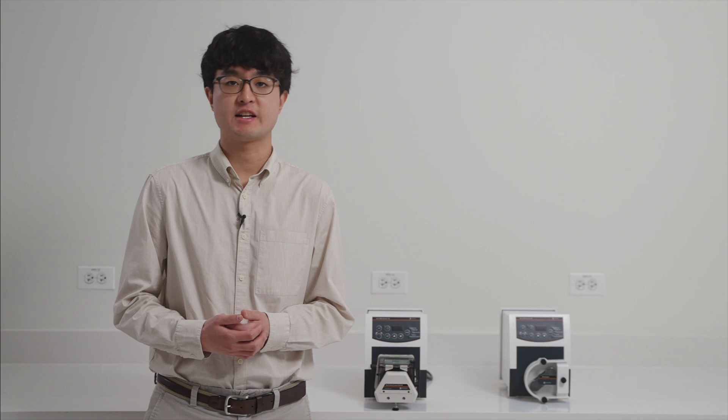Today we'll be talking about our High Flow Ultimate Peristaltic Pumps. The High Flow Ultimate is our most accurate peristaltic pump, making it suitable for tasks that require a degree of reproducibility and accuracy.